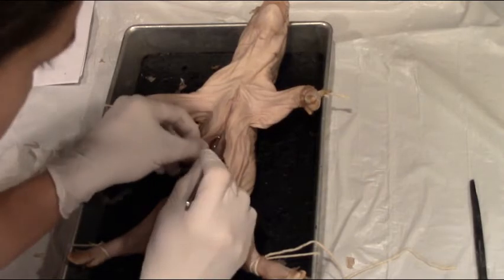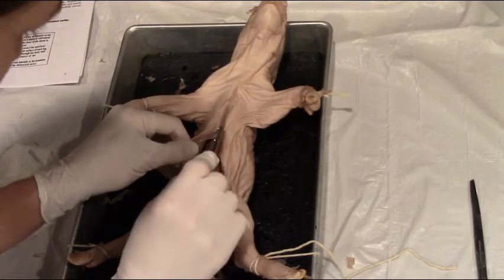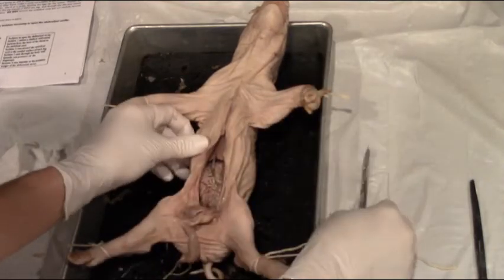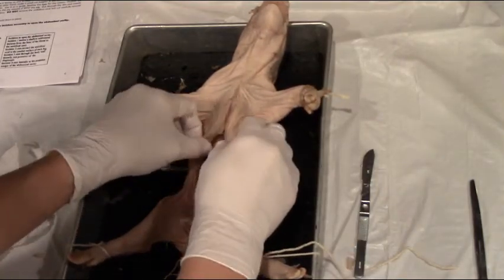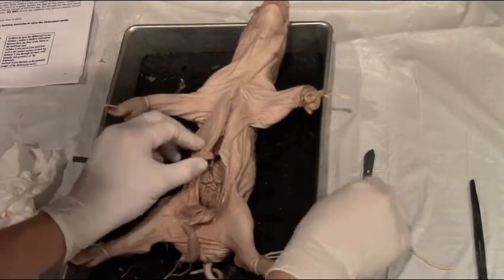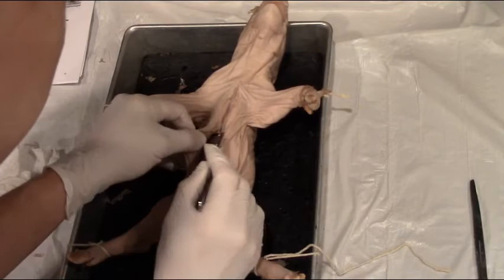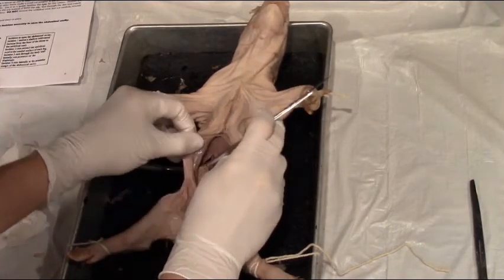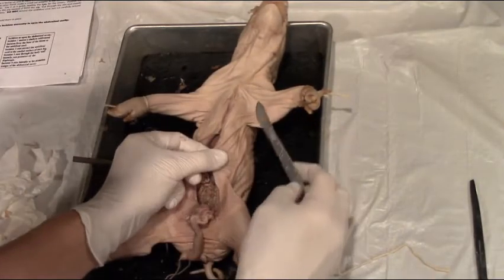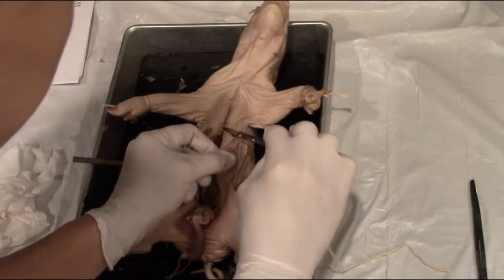Now I'm going to make incision three. Incision three is just posterior to the diaphragm and also just posterior to the ribs. You can see I'm feeling where the rib cage is. We don't want to cut the ribs — we want to cut underneath the ribs, posterior to the ribs. I'm pulling back; I know where my finger is so I'm not going to cut it. And that's incision three.